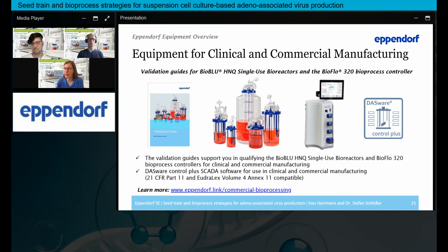Ines, it's probably you, or probably me. You can use the standard 1.8 to 2 ml vials. It is optimized, or at least our protocols are used, with 1 ml fill. So if you use higher fill volumes, you can of course adjust the program. In the beginning you need to test the program and you can adjust the steps, but we optimize it for 1 ml fill and standard 1.8 to 2 ml cryovials.